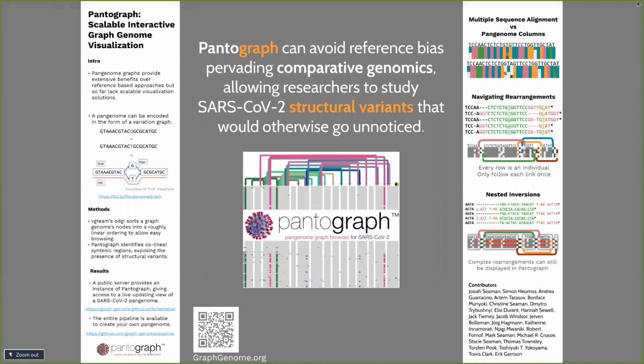In this talk, I'm going to present to you Pantograph, a scalable interactive graph genome visualization, showing you the potential of graph genome for comparative genomics.